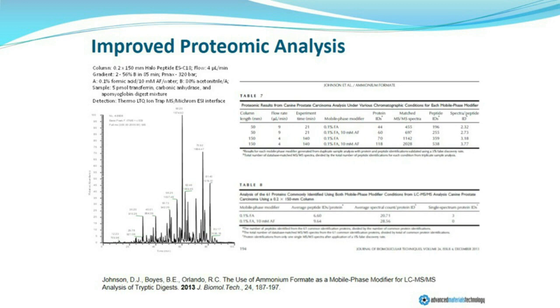And the results from this are shown in the reference attached to this slide, for those of you who are interested, but the net effect was better protein IDs, a greater number of proteins identified in a proteomic sample, and all of this results from essentially improved chromatographic separation with no net detriment to the online mass spectroscopic performance.